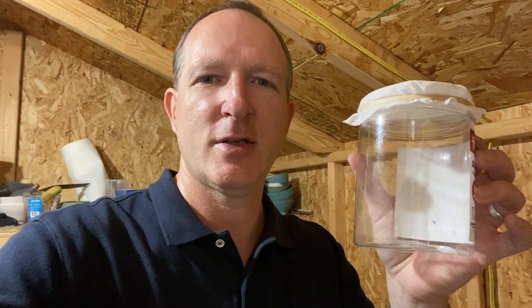All right, so we are actually about 24 hours later. I said 2 hours, but I decided it'd probably be good to wait maybe 24 hours, and that way give it a lot of time to digest, to see what the blood cells will look like after they come out of the mosquito. What I'm going to do is put this mosquito into the freezer for just a little bit. That'll calm the mosquito down so that when I open the container, it isn't just going to fly out. It'll be a little lethargic. So we're going to do that right now.